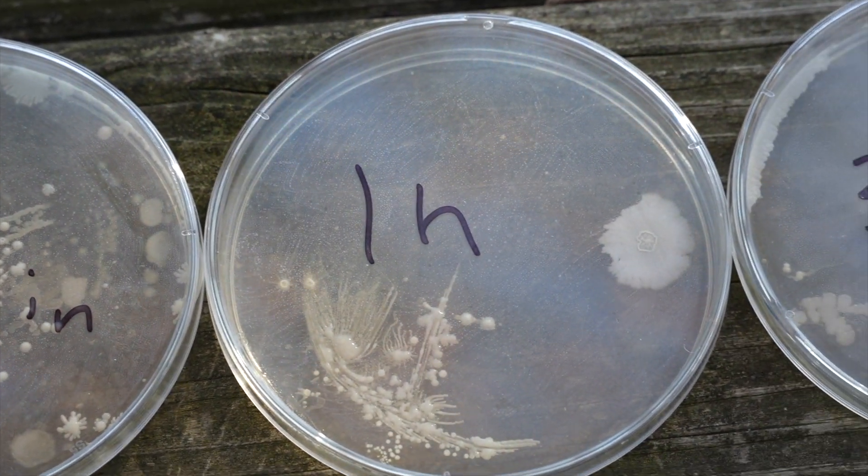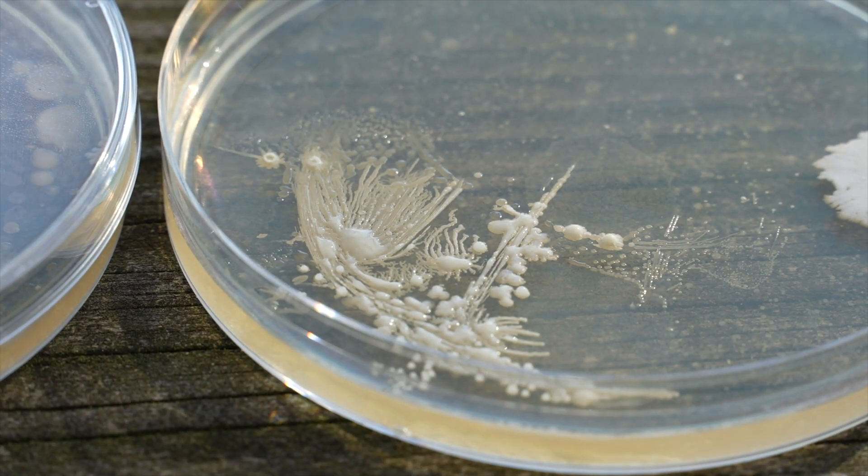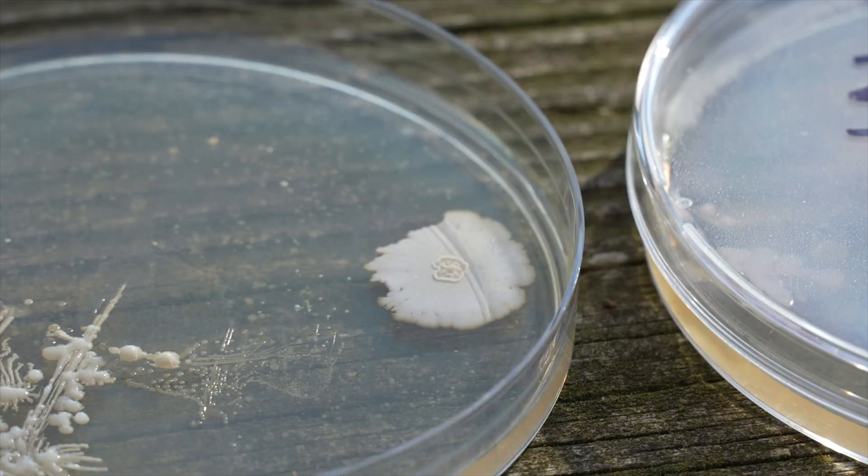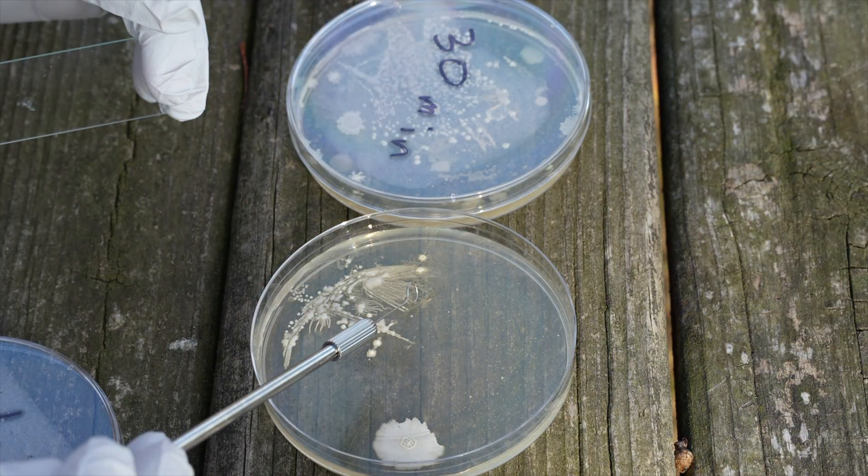Surprisingly, at the one-hour mark, despite having worn a glove while showering, it looks like many of these colonies were either killed or rubbed off. My hypothesis is that nitrile gloves weren't perfectly sealing off some of the soap, and that it provided an environment best suited for the Proteus and Bacillus species that we see on this petri dish.